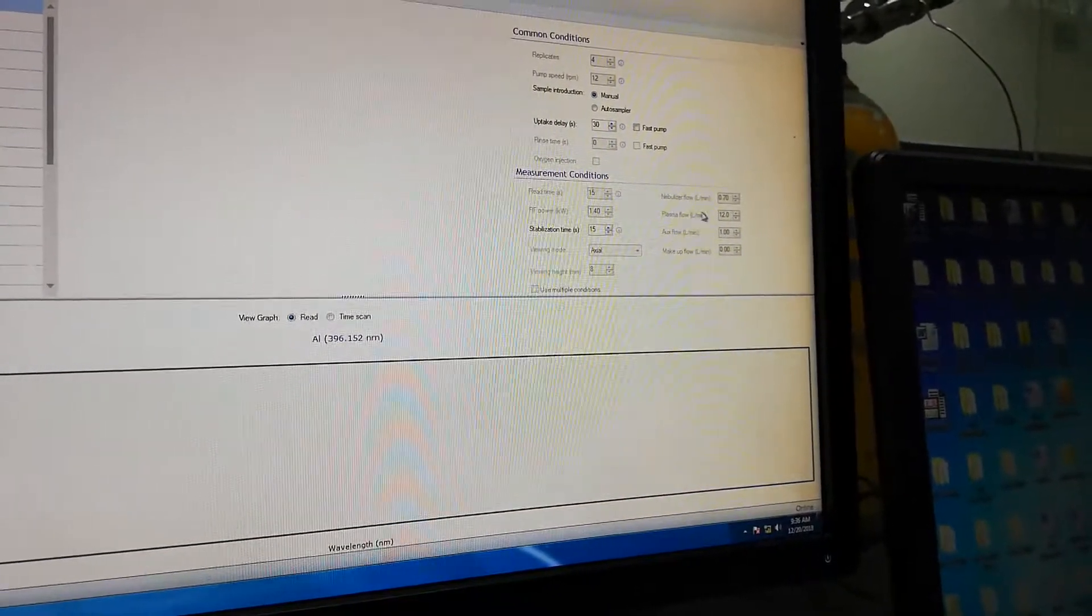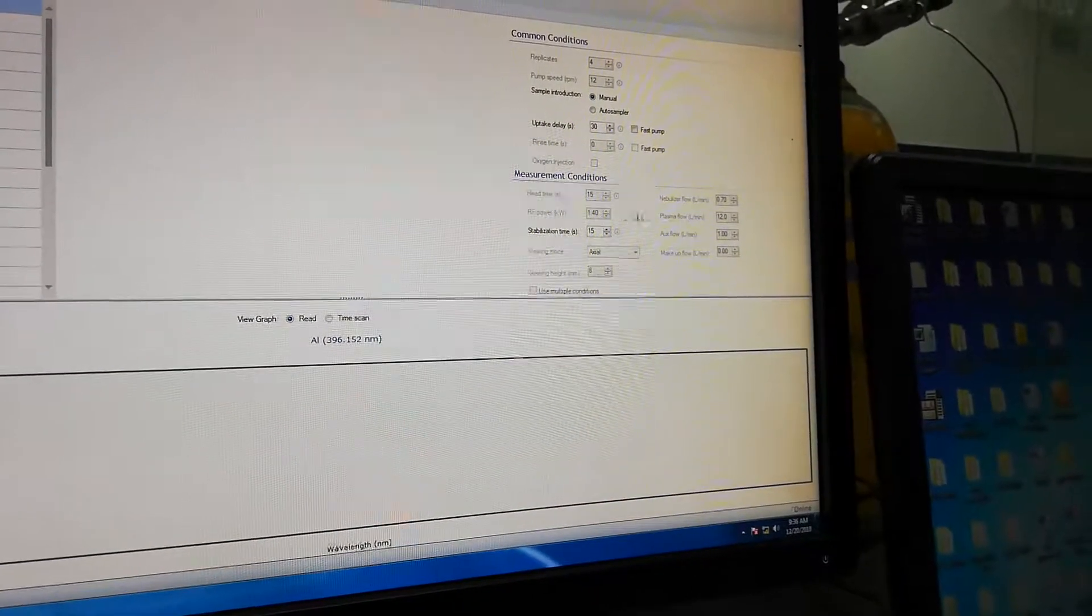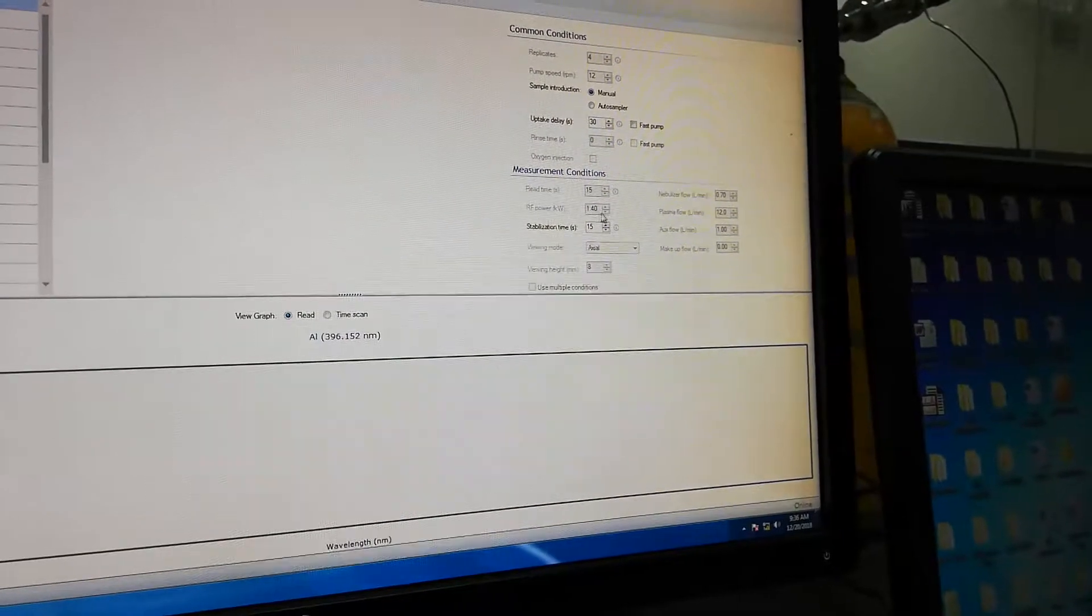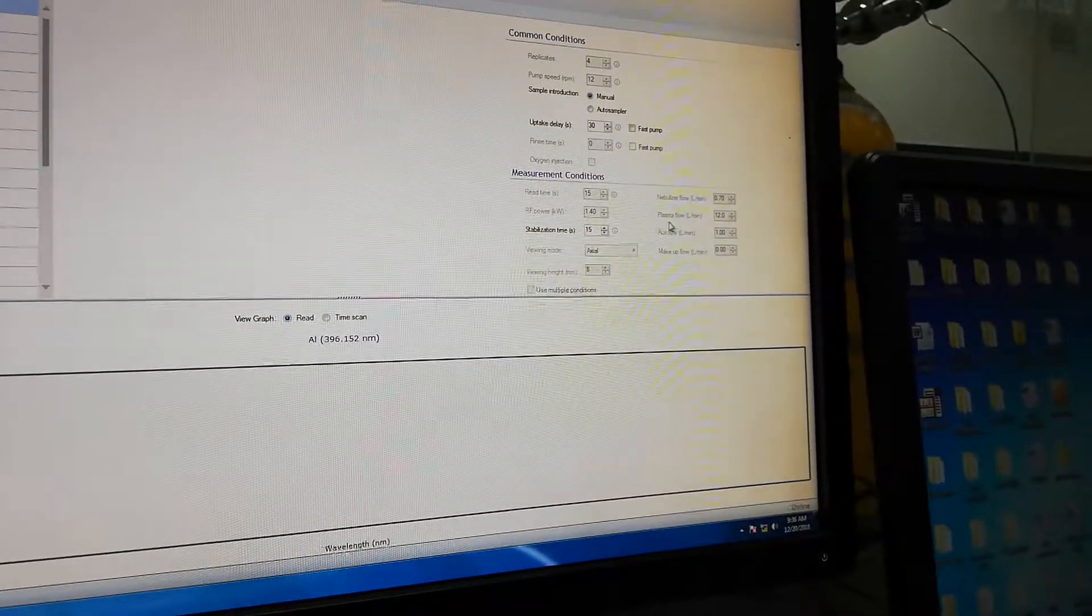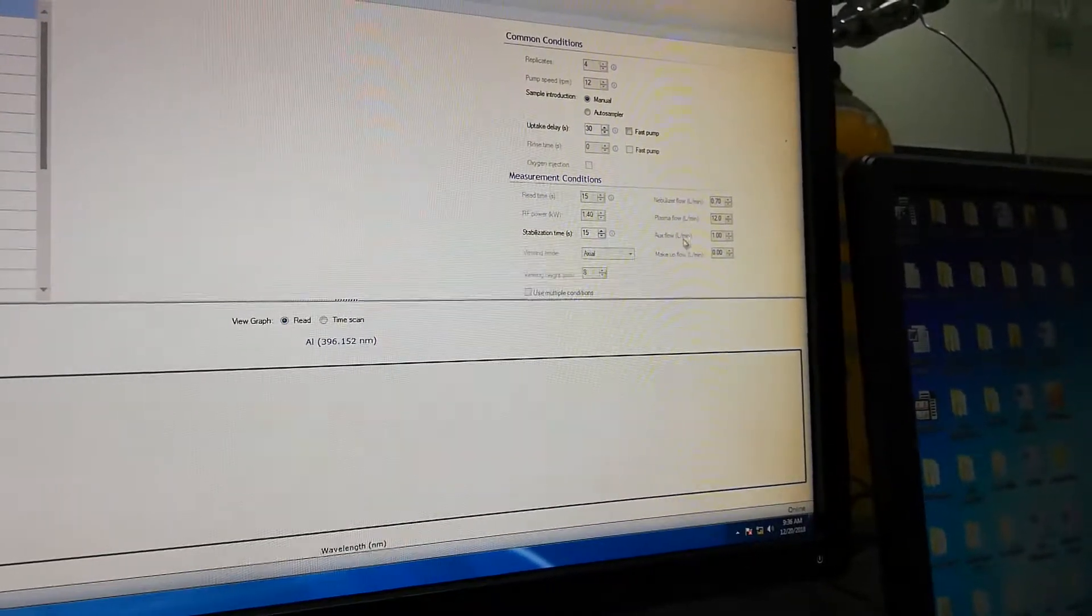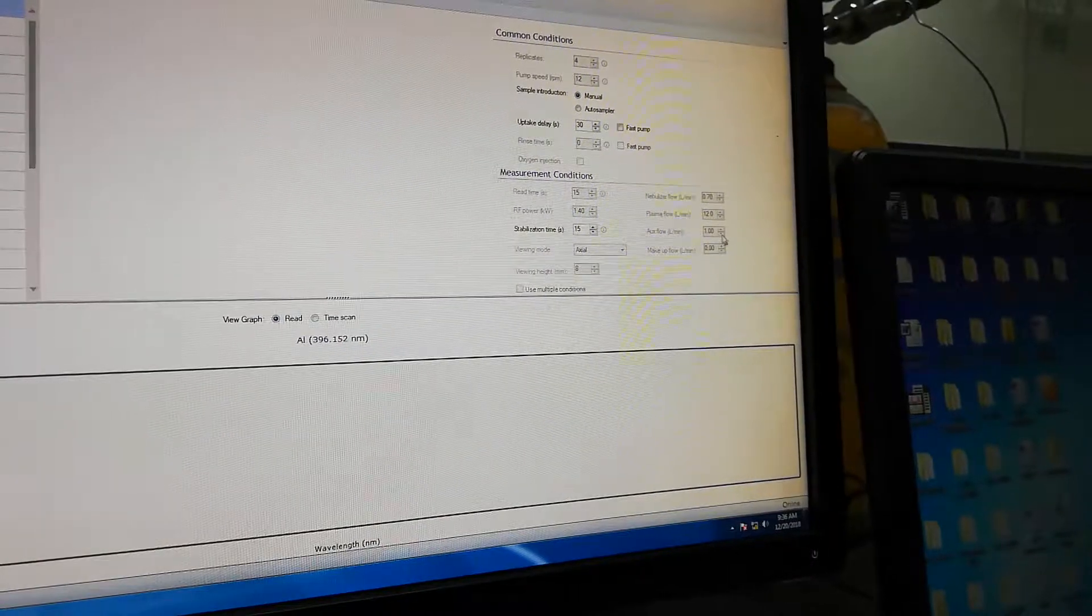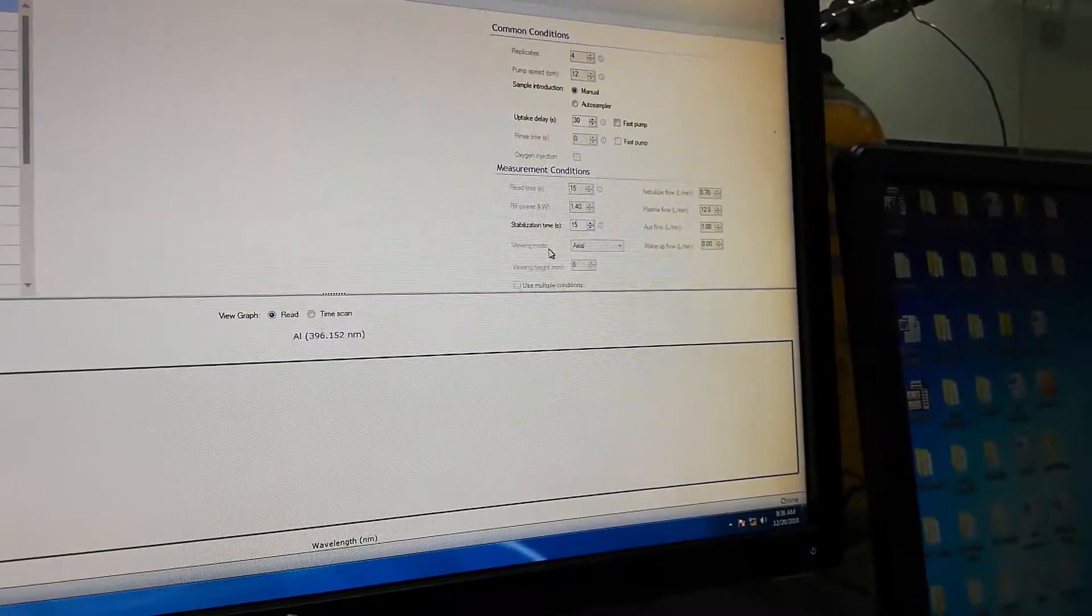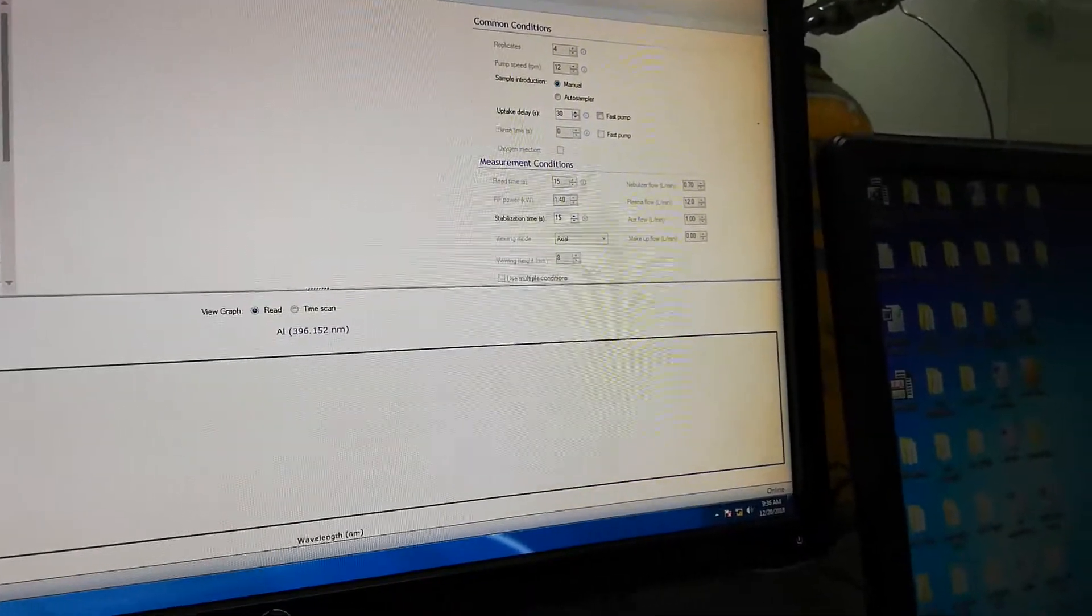Then measurement conditions: read time, nebulizer flow, RF power generation, plasma flow, stabilization time, auxiliary flow, viewing mode. These are the main parameters.